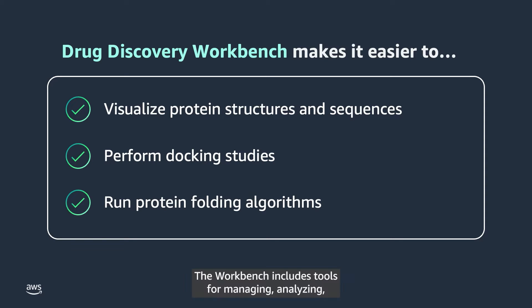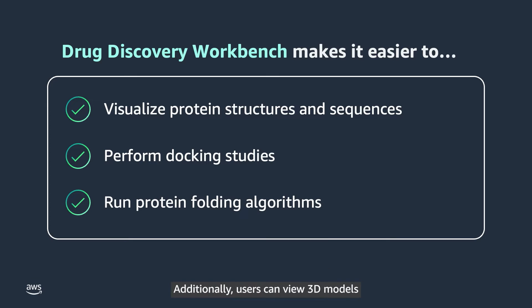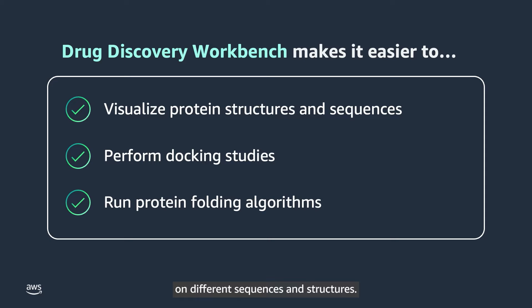The Workbench includes tools for managing, analyzing and visualizing predicted protein structures. Additionally, users can view 3D models and see what algorithms have been run on different sequences and structures.